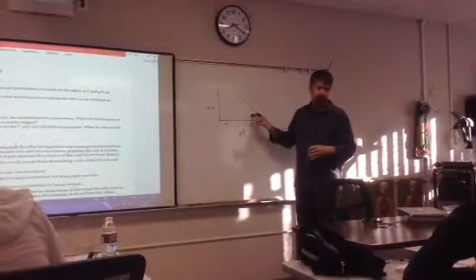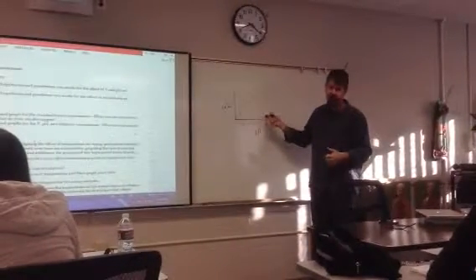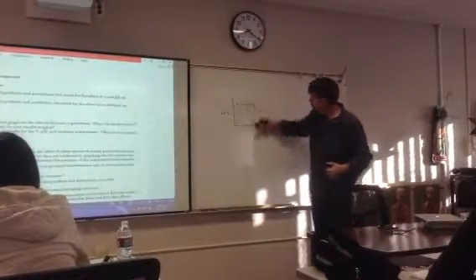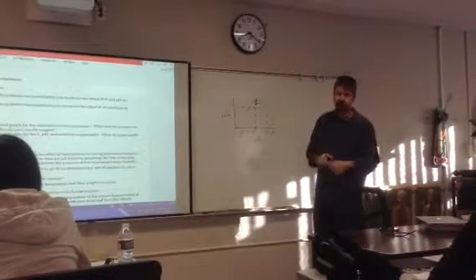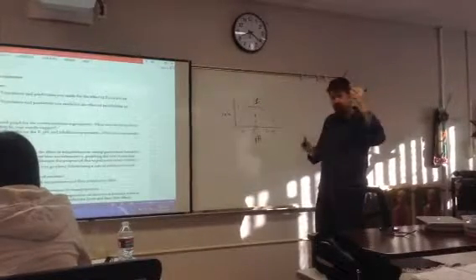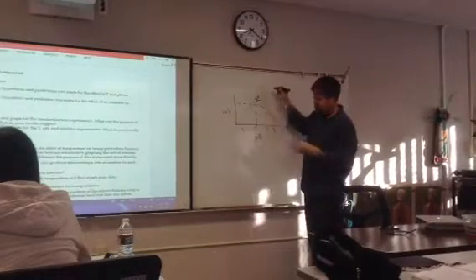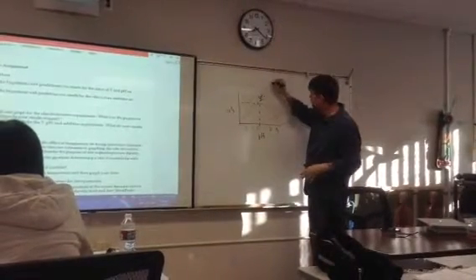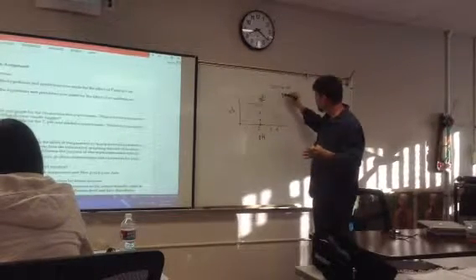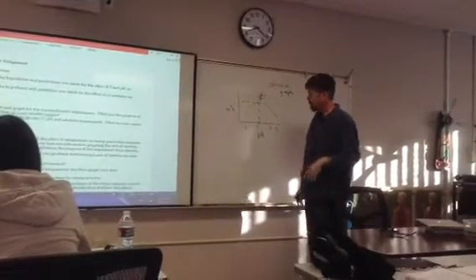This shows me the effect of pH on enzyme activity, at least this very specific reaction that I did. And obviously, wherever the rate's the maximal, that's the optimum. Could be broad, could be narrow, kind of depends, but there will be an optimum that we will derive from this. So this is the final product we're getting at. I can't remember if people don't like the word derivative graph because nobody really knows what that means, unless you've done one before. So I might have changed the language, but a derivative graph is a graph of the rates. It is the final product that we want to see.